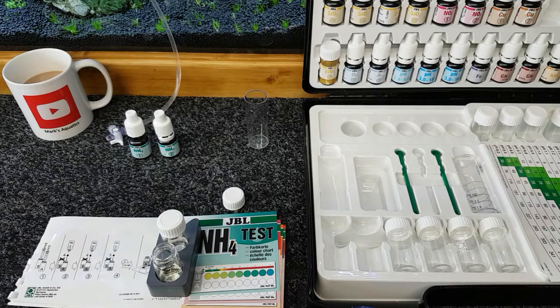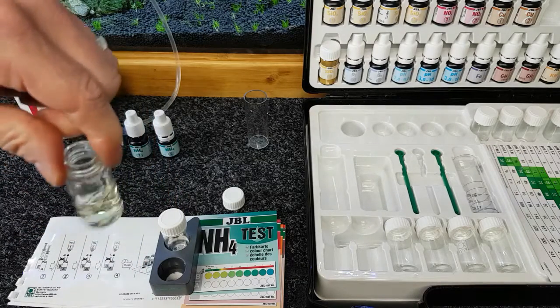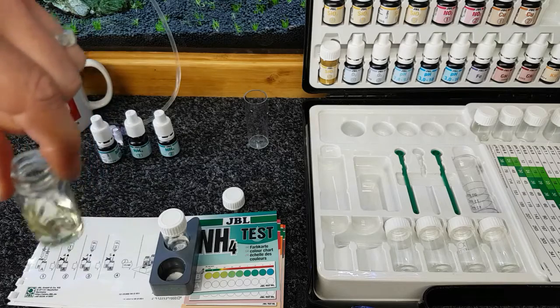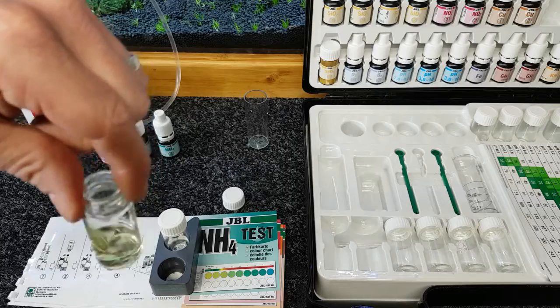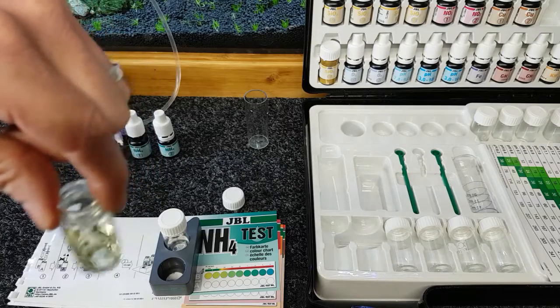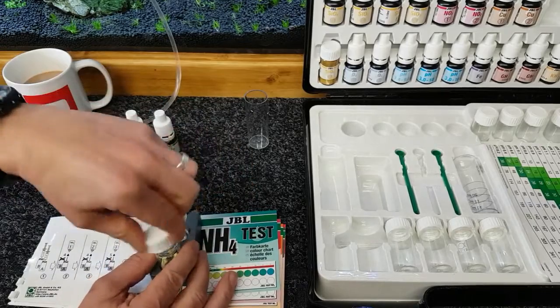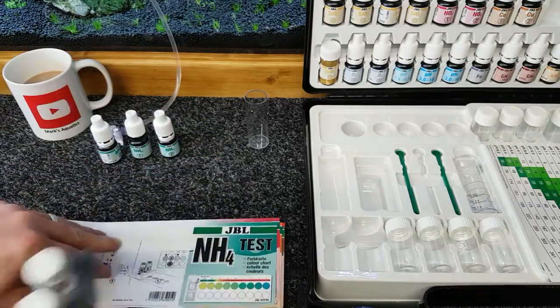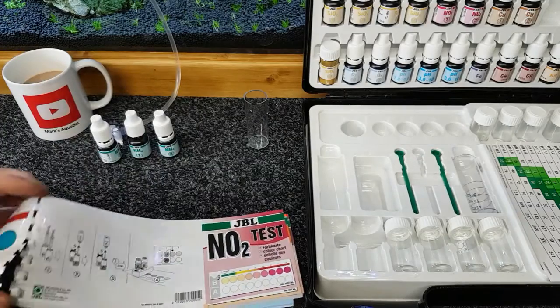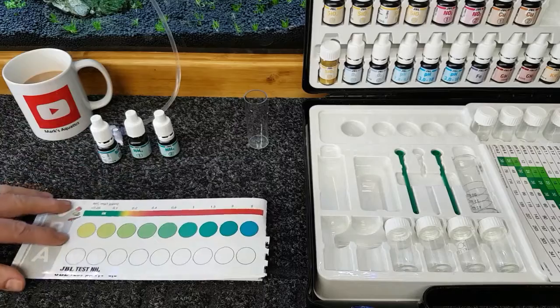Okay, and already you can see that's gone a yellowy colour. So we give that a good mix up, pop that back in there. Just going to pop that lid on a minute, and then we can turn over to our colour chart.